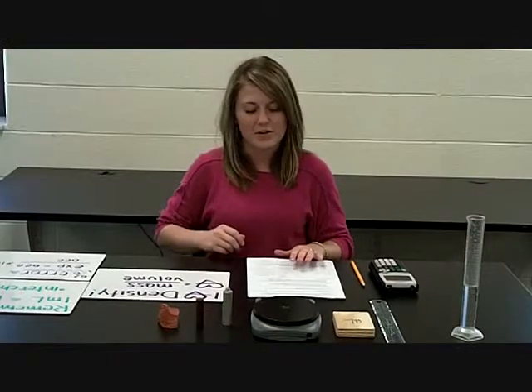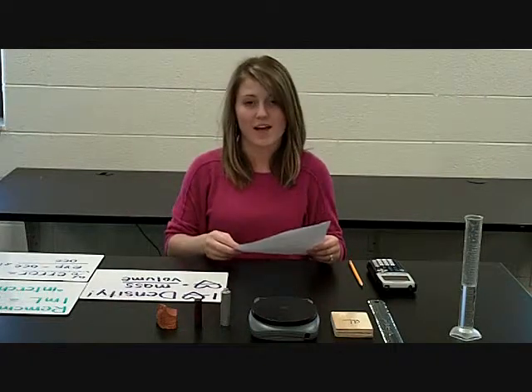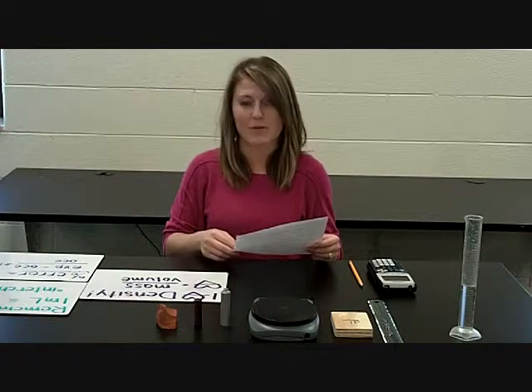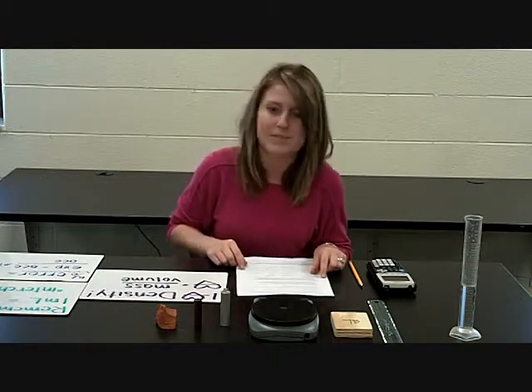Hi guys, today we're going over the Density of Common Materials lab. This is kind of a continuation of the last lab we did on volume, so we will actually be using some of the volumes that we recorded in the last lab.